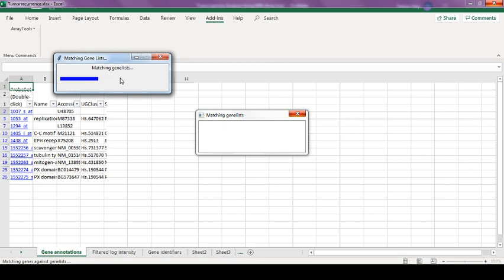I hope this tutorial will help all of you to perform all the BRB analysis yourself. You can see here that you don't need a lot of expertise of programming languages and different other things. Okay, so let's wait and wait and wait. Nobody likes to wait.